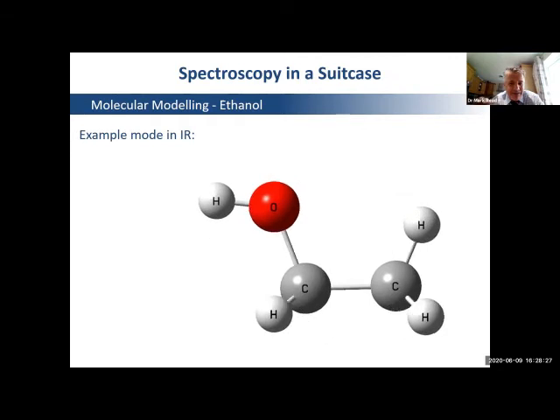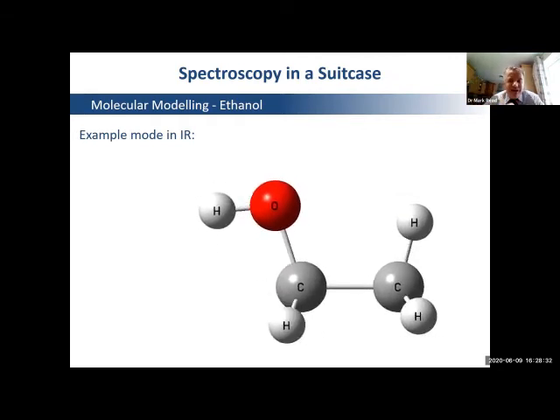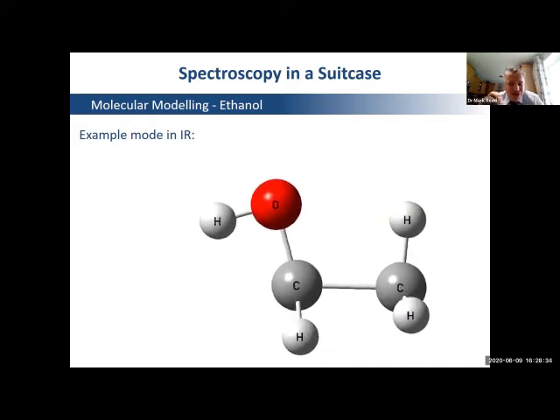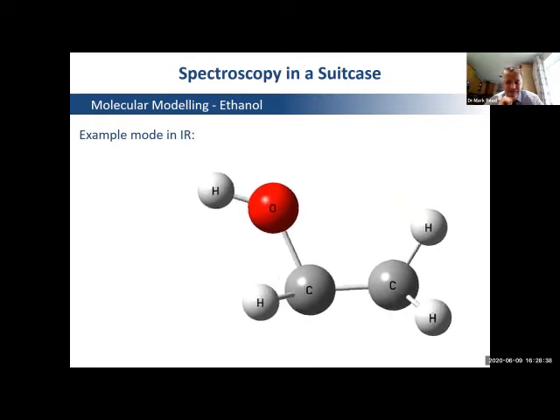I'd get a different pattern. That is why the fingerprint region gives us a unique pattern for each molecule. And that's useful when you're using it as part of a database interrogation.